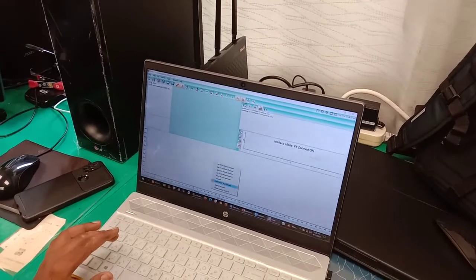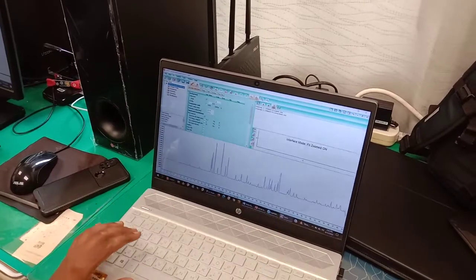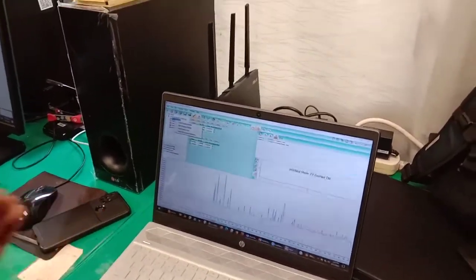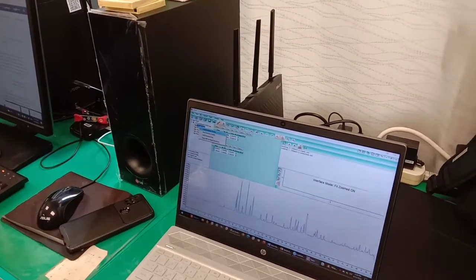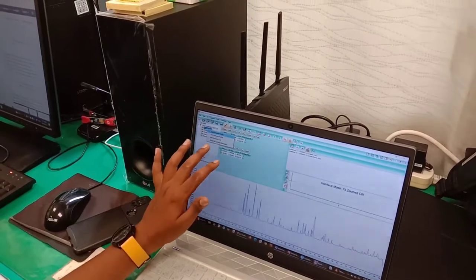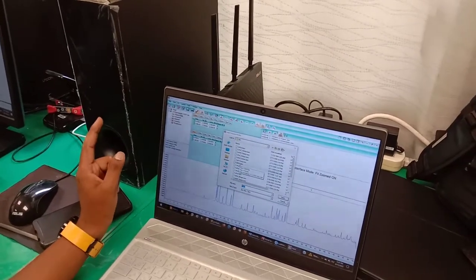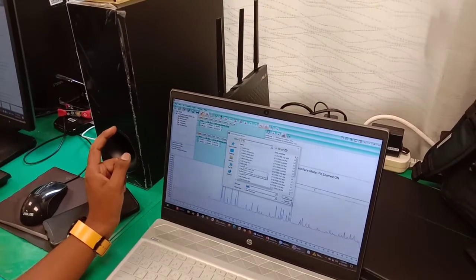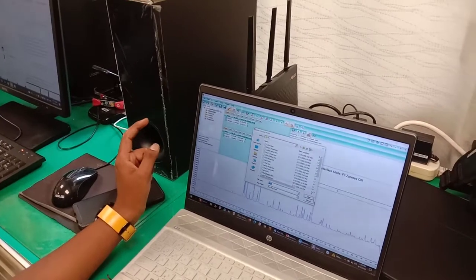So basically first you have to tell the Topas at what condition you actually measure this data, then only the software will know it. So first we have to tell our emission wavelength, I mean the XRD wavelength. You just right click here and say load emission, or you can directly say load emission file. Synchrotron is only one wavelength, so you can choose copper alpha 1. If you're using third floor second floor XRD, you choose copper alpha 5.